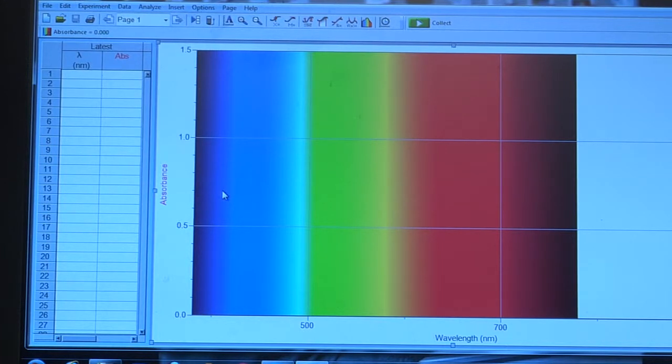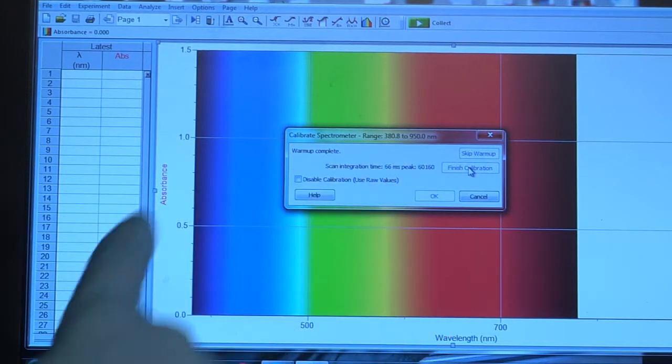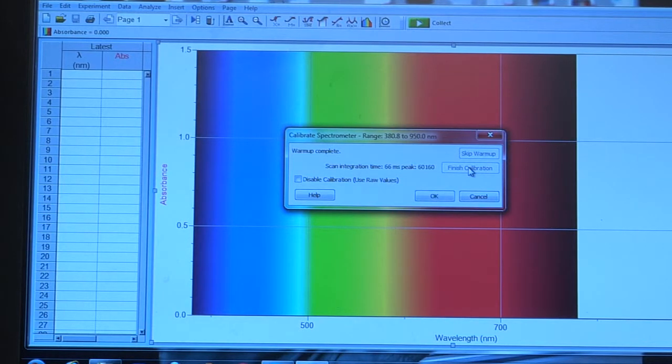Which means that there is the amount of light that's actually passing through. So if you look carefully right here, you can see it's doing a scan of all of the visible wavelengths.